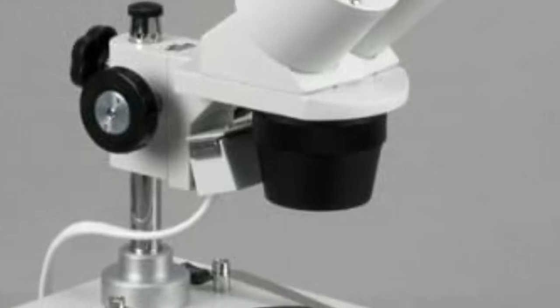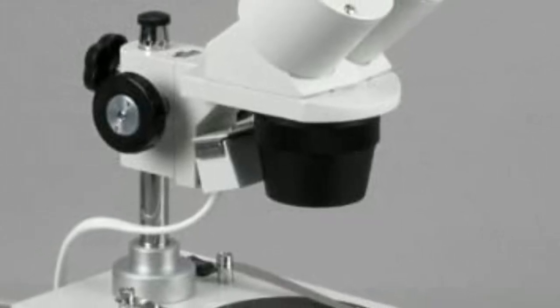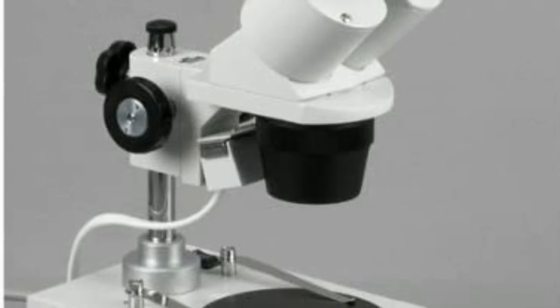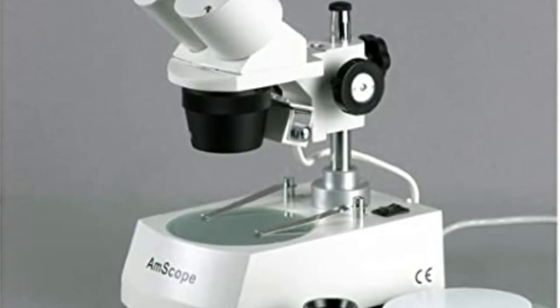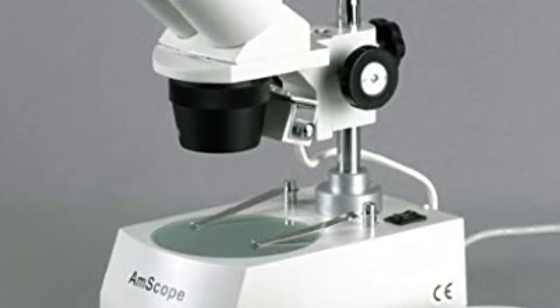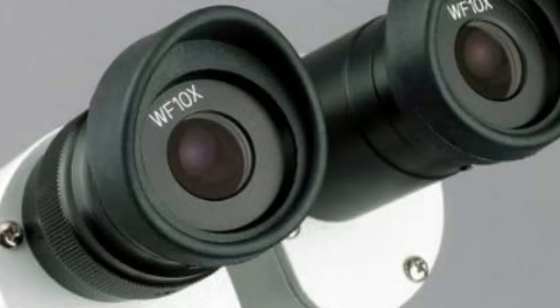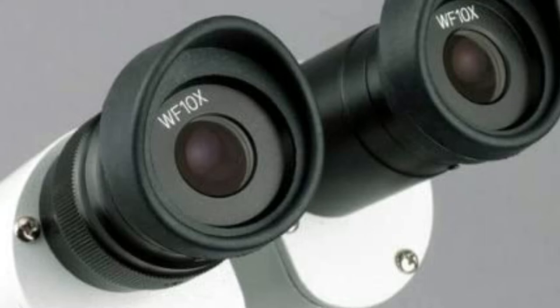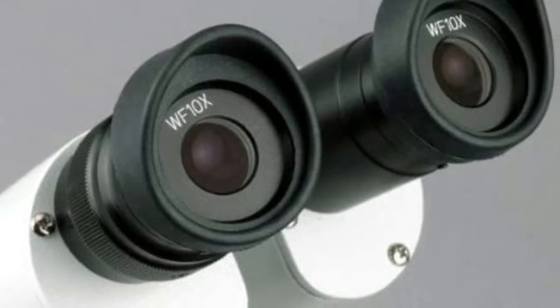The AMSCOPE SE306RPZ forward binocular stereo microscope is ideal for both home and school use. The binocular viewing head of this microscope has an interpupillary range of 55 to 75 millimeters. This allows for the range to be adjusted to the specifications of individual users.